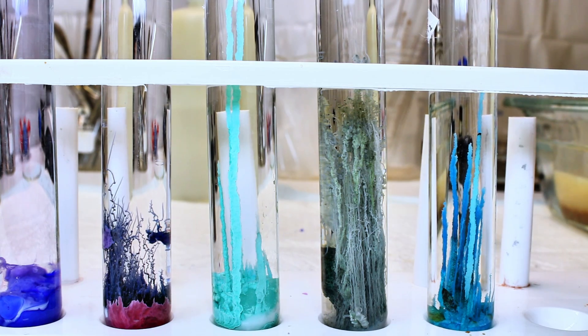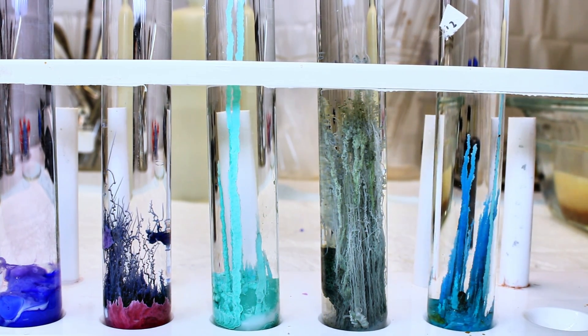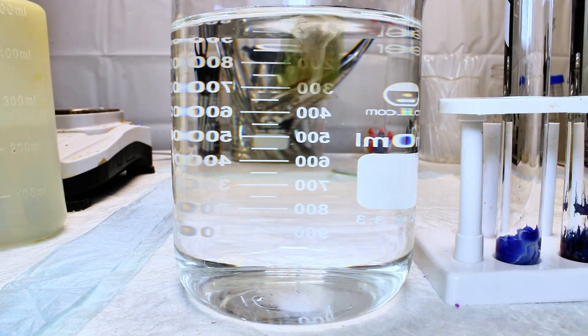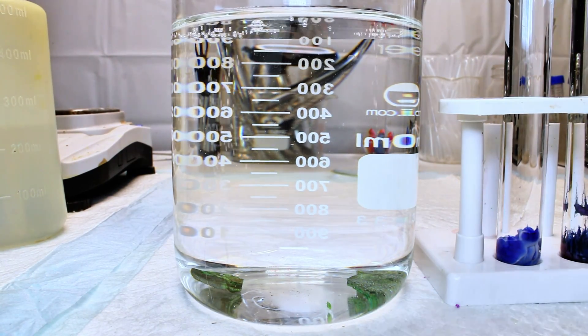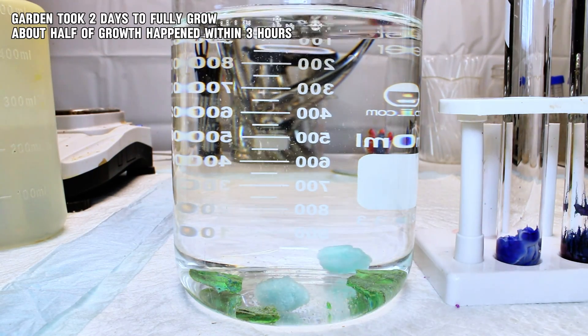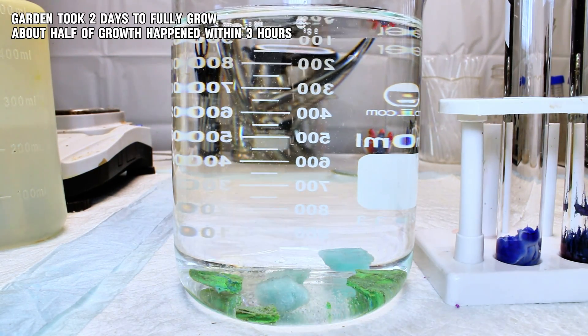At this point, to make my full size garden, all I do now is take crystals of my selected salts and toss them into my 1 liter beaker of dilute sodium silicate and watch them grow. It took about two days for the garden to reach its maximum size, with the rate of growth dropping off exponentially after only about three hours.